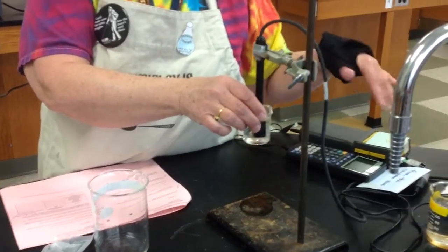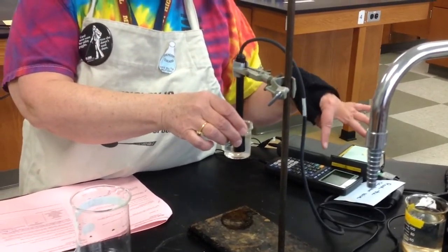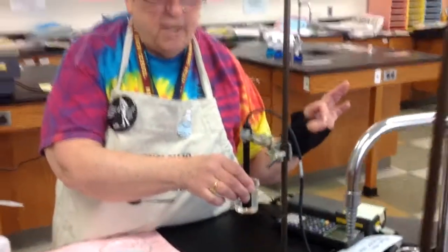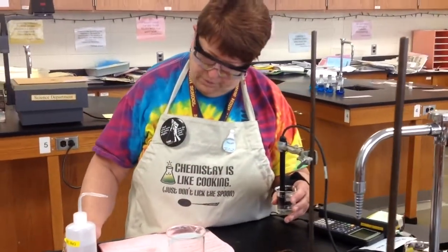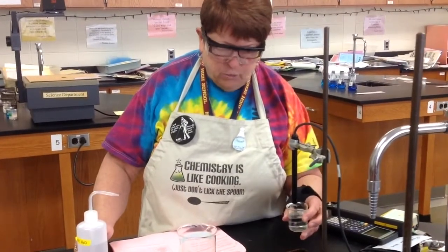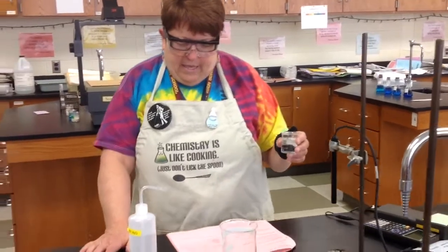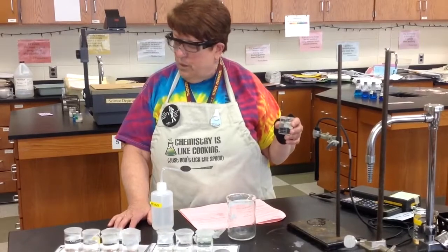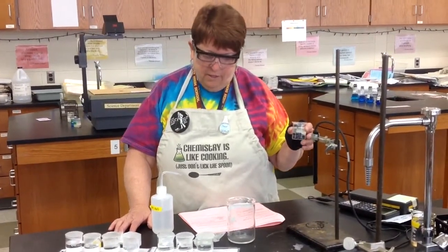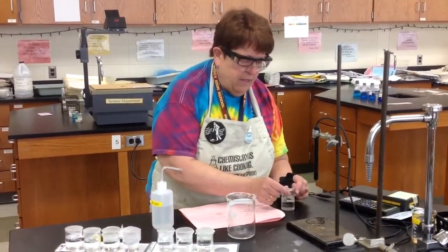And then next to me is a calculator that has a reading on it. You write down what that reading is off the calculator. This is a measurement in something called microsiemens. It's a measure of conductivity. If you have less than 200 microsiemens, since we're doing 200, right? 200 or less, you're going to call it a non-electrolyte, which you can record later, but you might want to make a note of that right now.